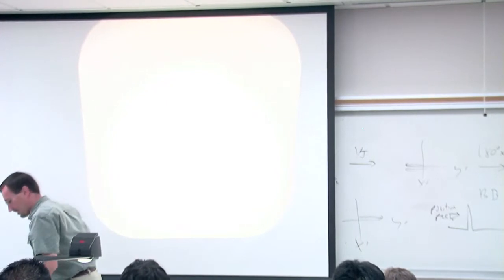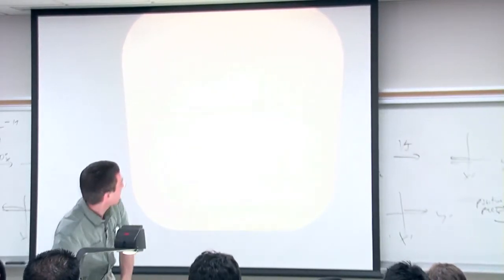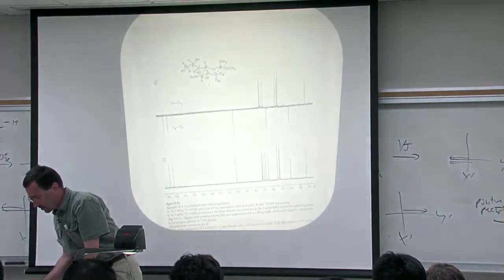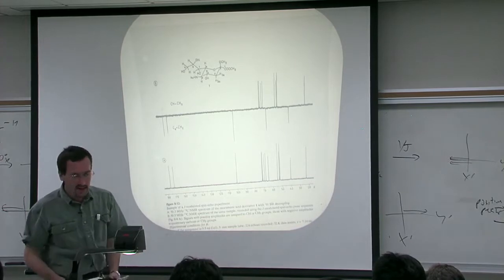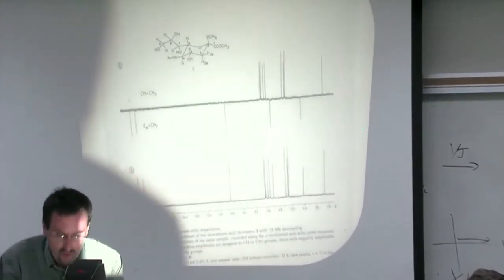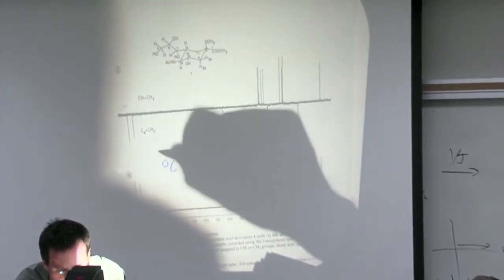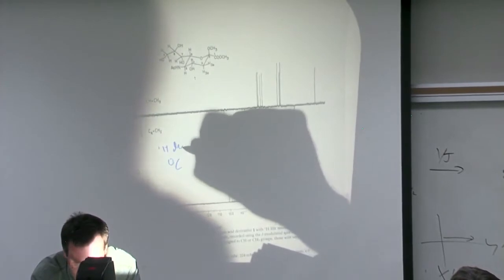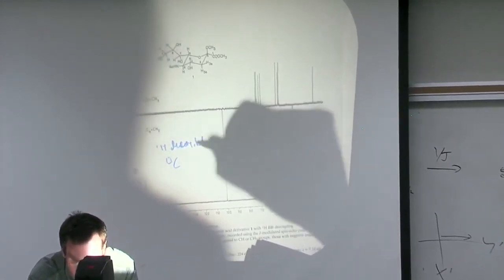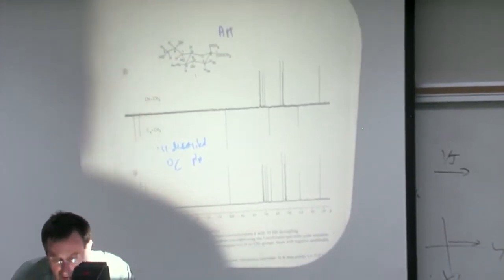All right. So this is one I pulled from the supplemental book Friebolin, and it's just an example. It's a sugar molecule. And this particular sugar, they ran an APT experiment. So here you have a regular C13, and this is, of course, your H1 decoupled. You always run H1 decoupled these days, C13 NMR. And here's your APT experiment on the sugar.